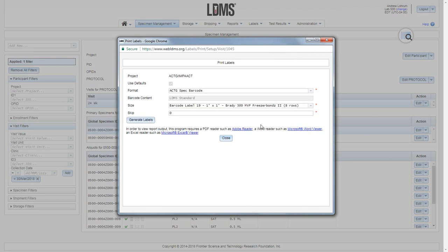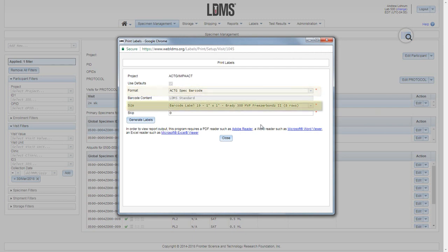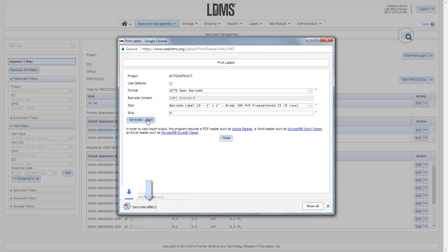You come to the print labels screen, where you need to set the format and the size if not already chosen for you. Clicking generate labels will create a PDF that you can then open in Adobe and print to your label printer.